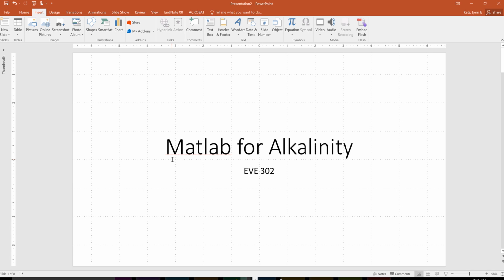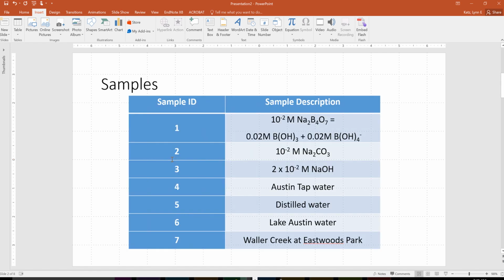Good morning. This is the final part of the alkalinity videos. In this one, we're focusing on MATLAB for alkalinity. So we're going to be talking about how we use that MATLAB code to generate the data analysis that we need. To do this, first we're going to talk about the samples.